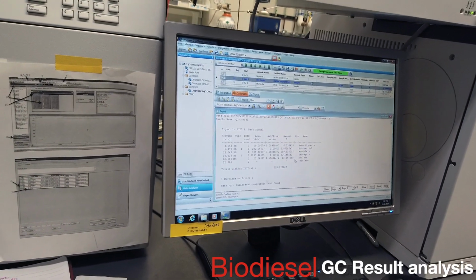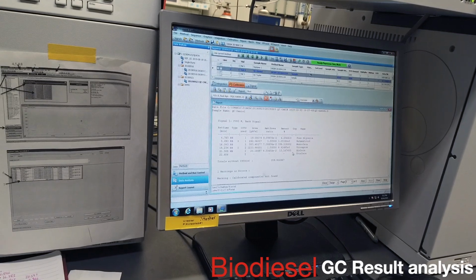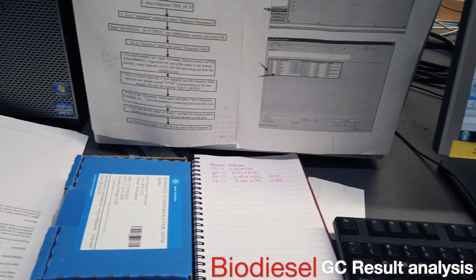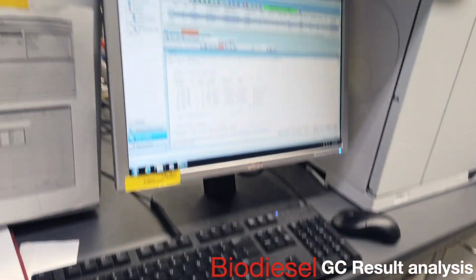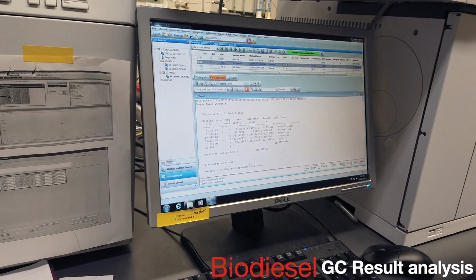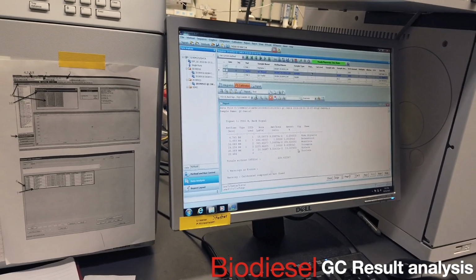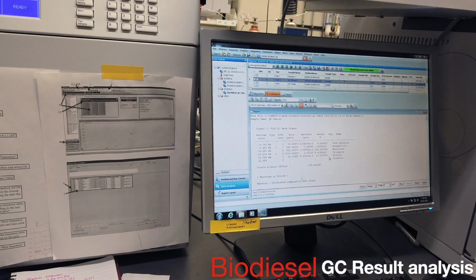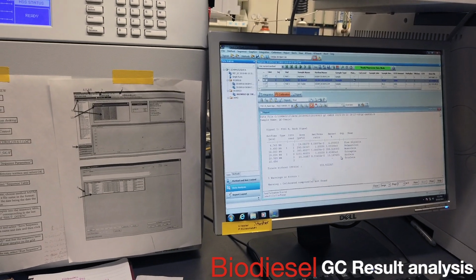All right, so I just need to figure out, because what I did was I took the numbers from this and put them in at face value. And the weights that I put in need to correspond properly. Either you put it as milligrams or as grams, and those all compound.